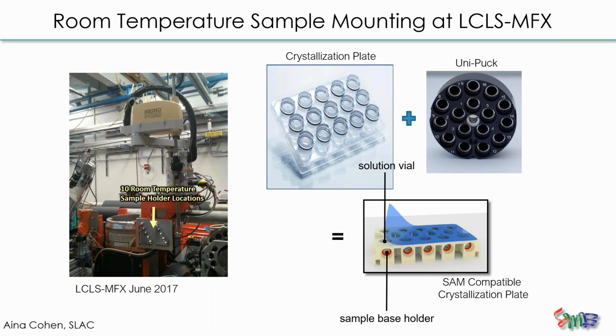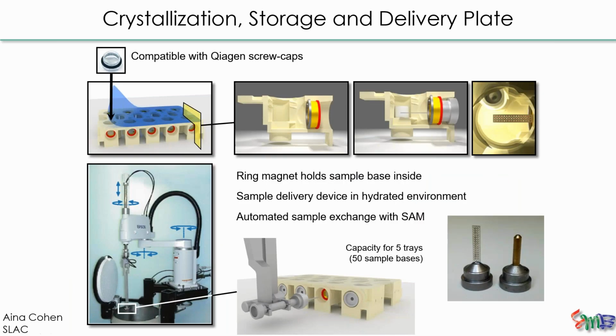And so the goal here was to generate a robotic compatible crystallization plate. And it has already been implemented. You're going to see some prototypes in just a second.